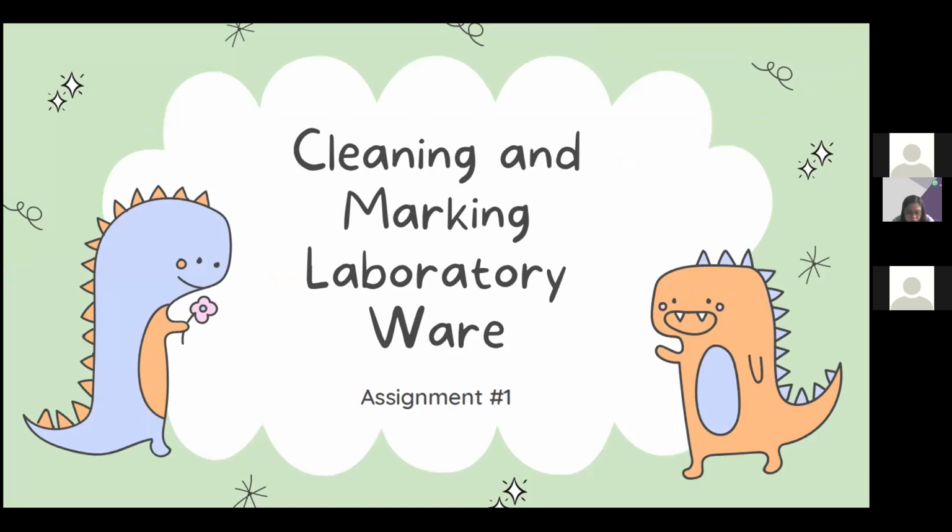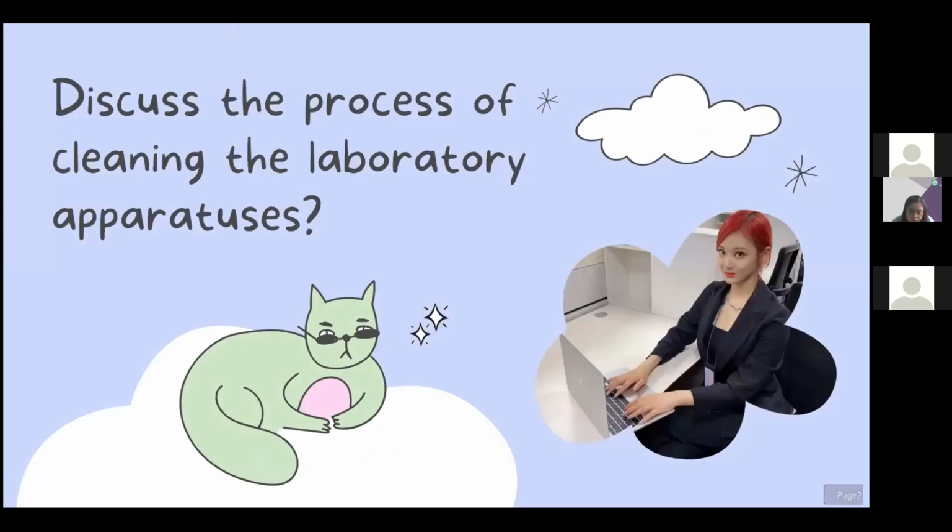So good afternoon again, everyone. This is the answer of group one for assignment number one about cleaning and marking laboratory ware. Discuss the process of cleaning the laboratory apparatuses.